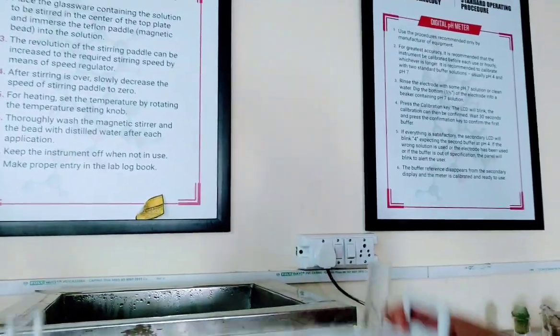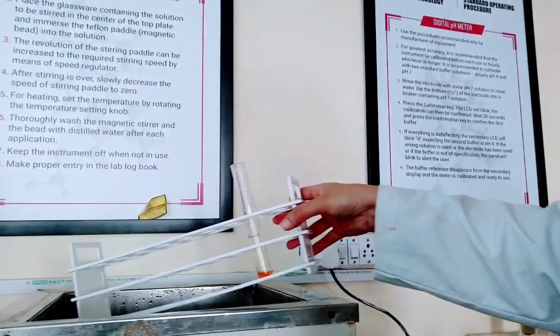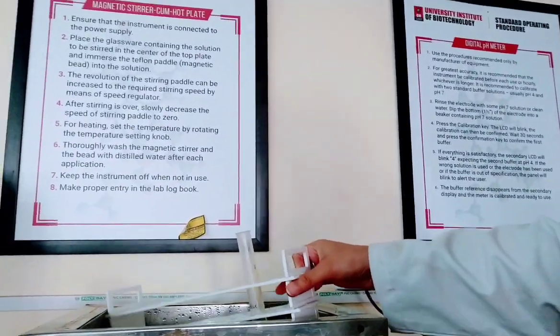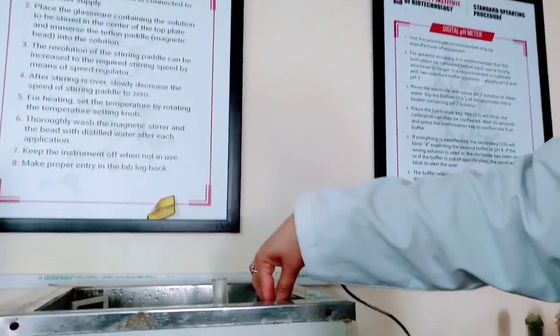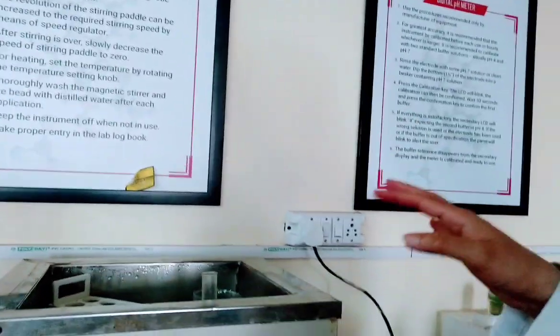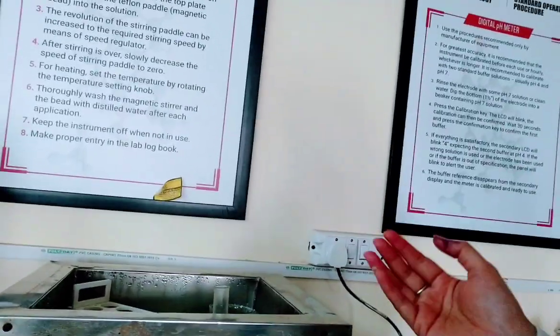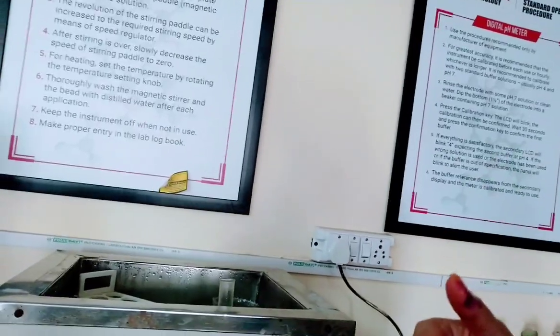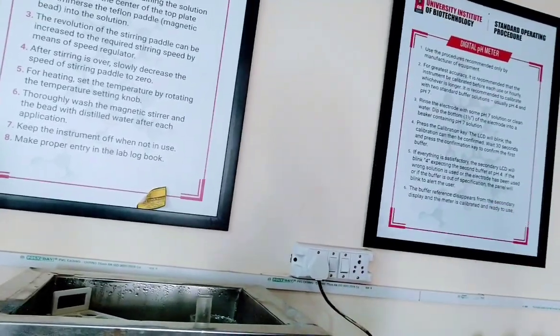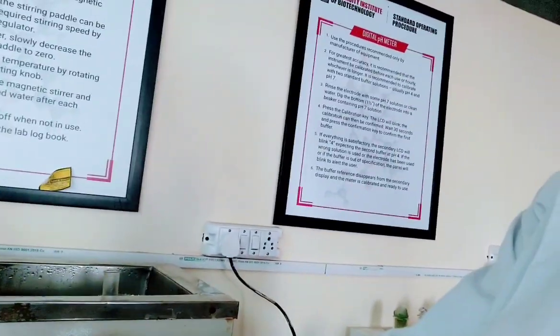So we have already added this nitric acid to our 1 ml of sample. I have taken a protein sample, and if it has an aromatic amino acid, then this test will come out positive. I am keeping my test tube for 1 minute inside the boiling water bath. We have to give it 1 minute. After that I will take it out, cool the test tube, then add sodium hydroxide and observe the yellow-orange colored precipitate formation.